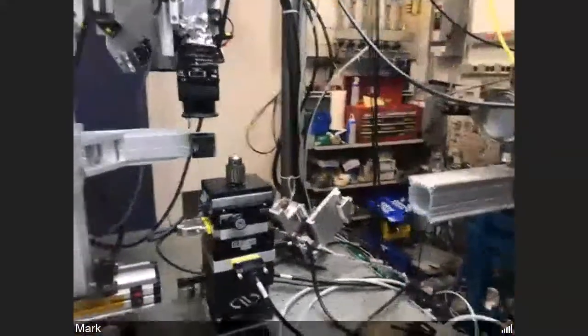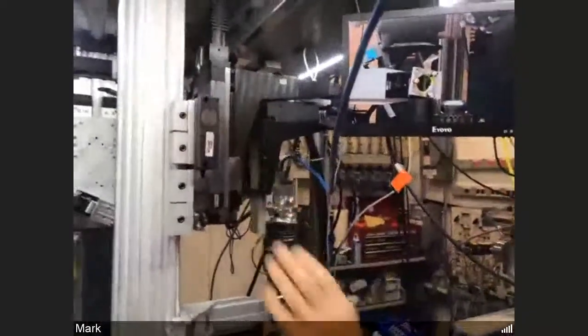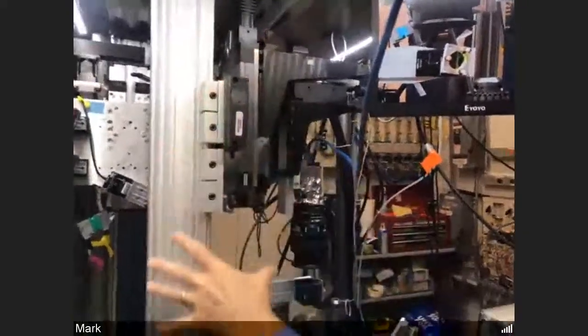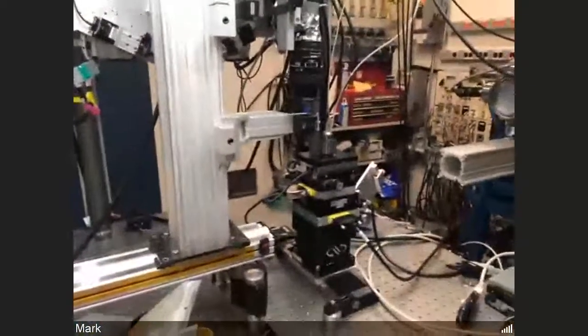That camera is connected to an XYZ stage and also a rotation to position it in the beam. And then that entire camera tower here is on a translation stage that goes down the beam line away from the sample. So that's how we do phase contrast: we just increase this distance. Right now it's about 40 millimeters from the sample to the scintillator, but we could increase that to a couple of hundred millimeters to increase the phase contrast.